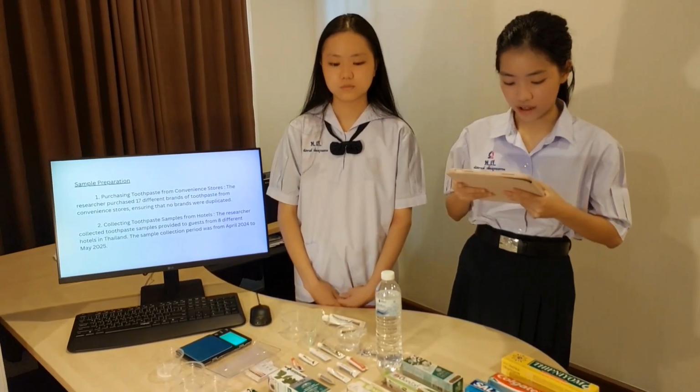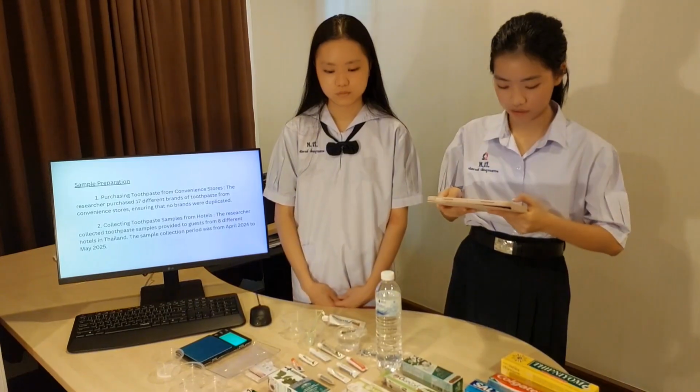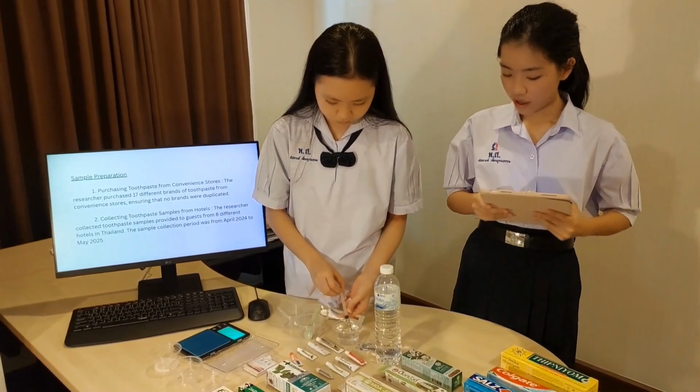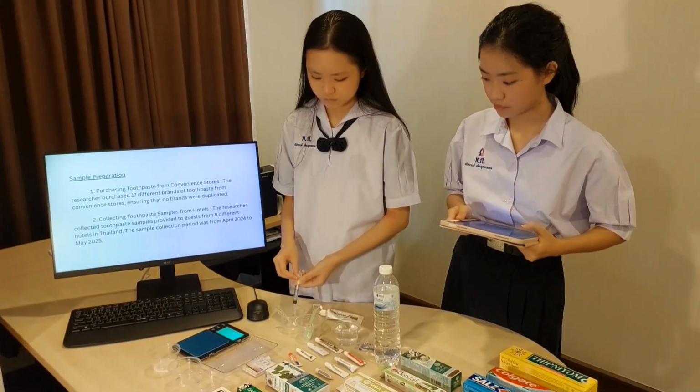Add water at a ratio of 1 gram of toothpaste to 3 milliliters of water. And the mass of the spoon is 0.75 grams.